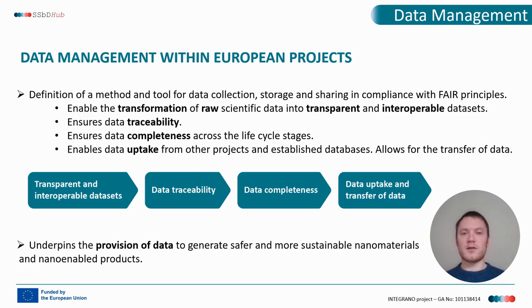And so in INTEGRANO, where we will use all of this data to generate safer and more sustainable nanomaterials and nano-enabled products, the challenge is for us to collect and organize all of the data in a way which is useful and where we can keep track of where the data came from, what it represents, and also to ensure that data is complete, that enough useful data has been collected to avoid the researchers having to go back and repeat experiments.